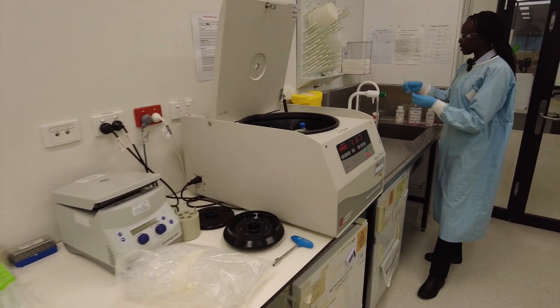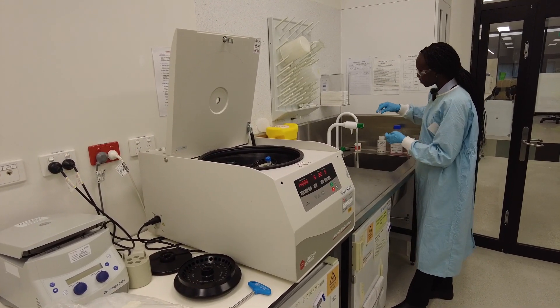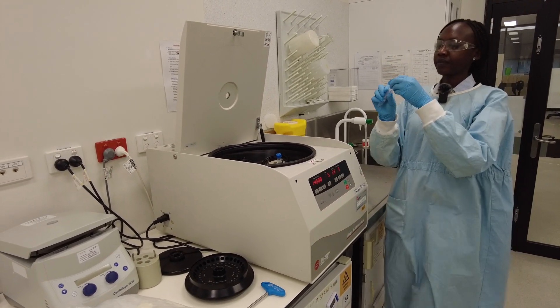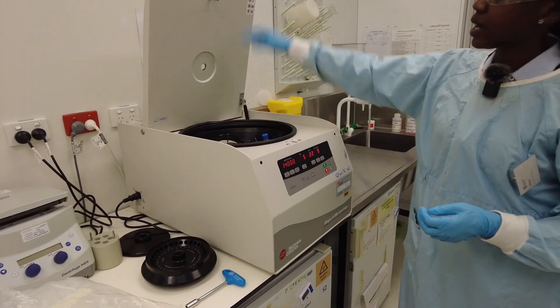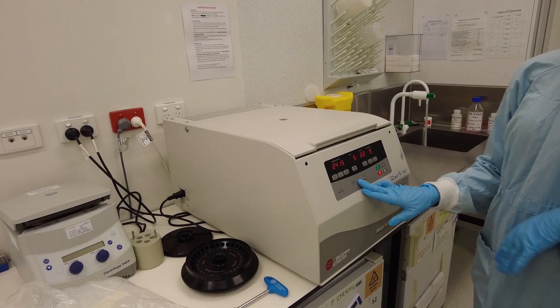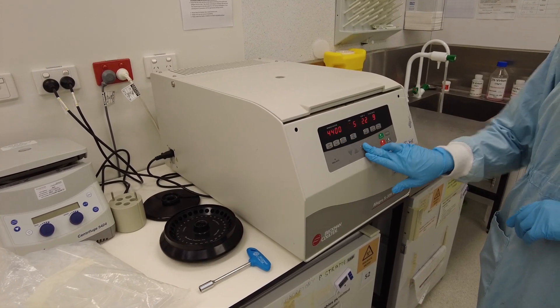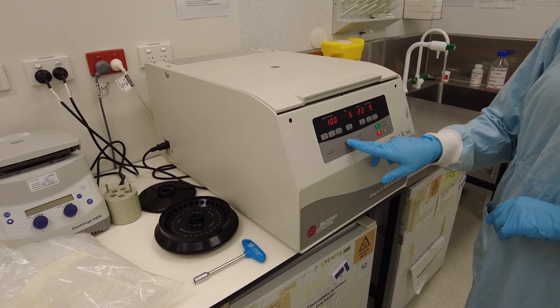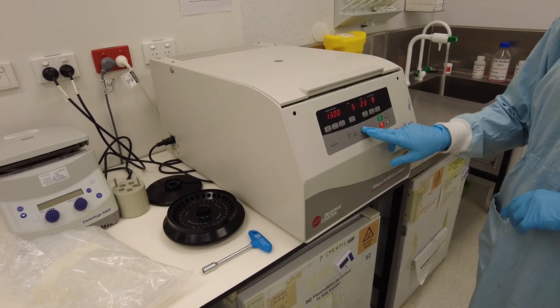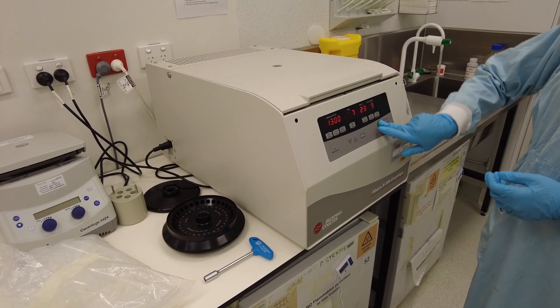We have to balance our tube with another tube of the same volume, about four mils. We're going to close the centrifuge. Our rotor is the 4400, and we're going to do about 1300 RPM. We'll do it for about seven minutes, which is the average. Temperature is about room temperature. Press start.